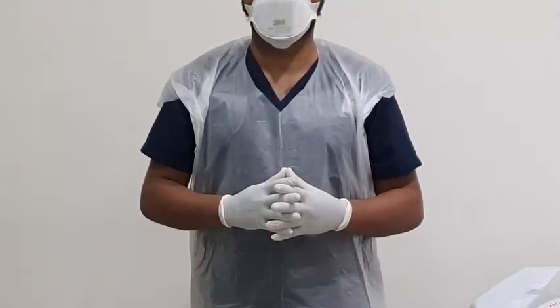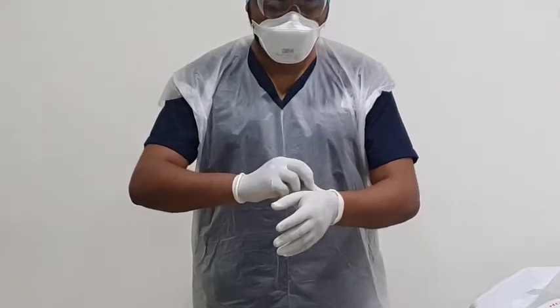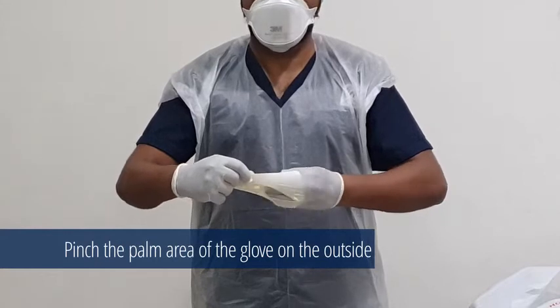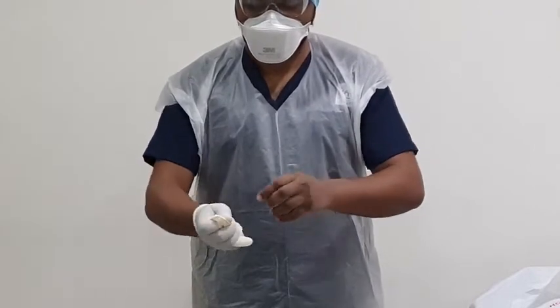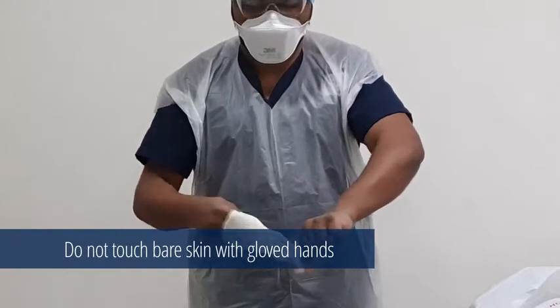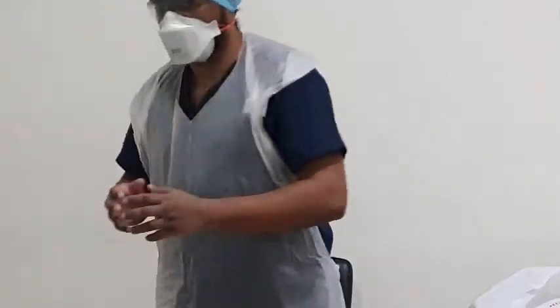Using a gloved hand, grasp the palm area of the other gloved hand and peel off the first glove. Hold the removed glove in the gloved hand. After removing the first glove, slide the fingers under the second gloved hand and peel off the second glove over the first glove. Discard the gloves in a waste container.